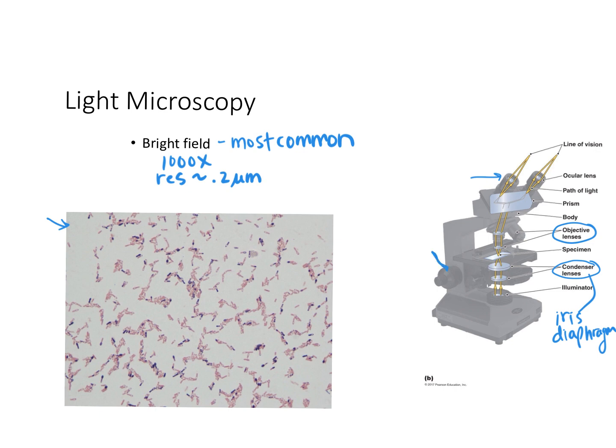There's going to be a big knob, that's a coarse focus, that will move the stage up and down quite rapidly, and a fine focus that will move it in minute amounts. Okay, let's see, what else did I want to say about that? I guess that's pretty much it.